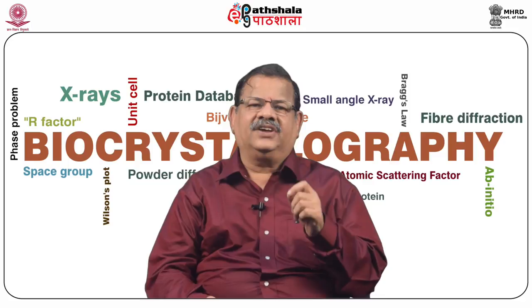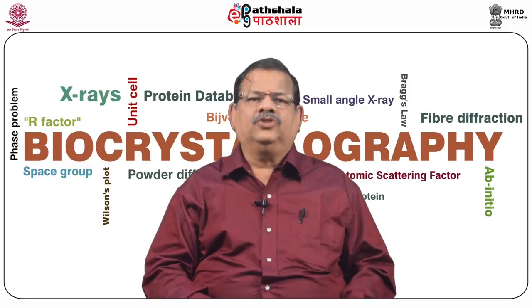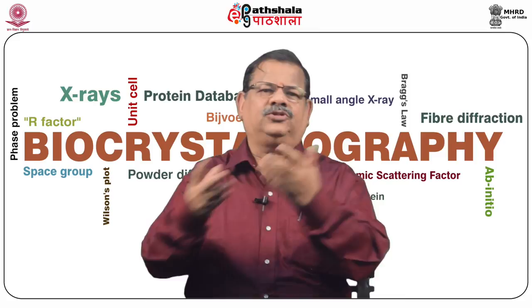So you are going to use this crystal only for the X-ray diffraction experiment, and we are going to collect the Bragg intensities. So the purification of the sample plays a major role, because the utmost pure compound will give good diffracting crystals, which will give good data, because we are using data only to produce the model. So that is why compounds should be 100% pure.